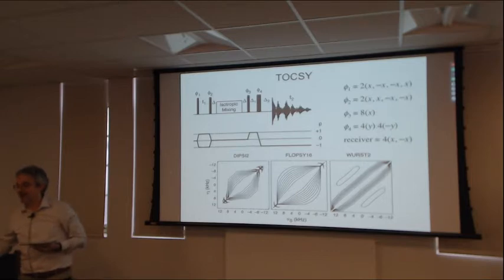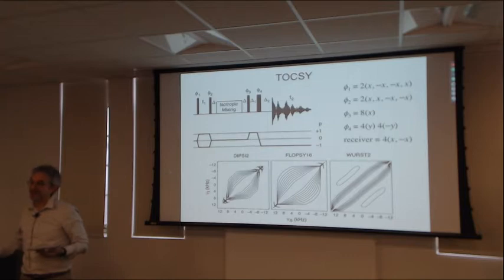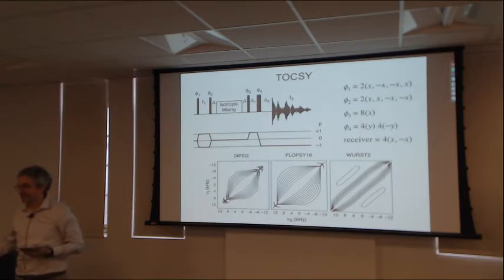But somewhere around 1990, 1989, the approach started on, let's forget about analytic solutions or solutions we understand. Let's just turn a computer loose and tell the computer we would like the chemical shift to be averaged to 0 over some bandwidth, or we would like the scalar coupling to be averaged to 0 over some bandwidth, and just see what the computer came up with.